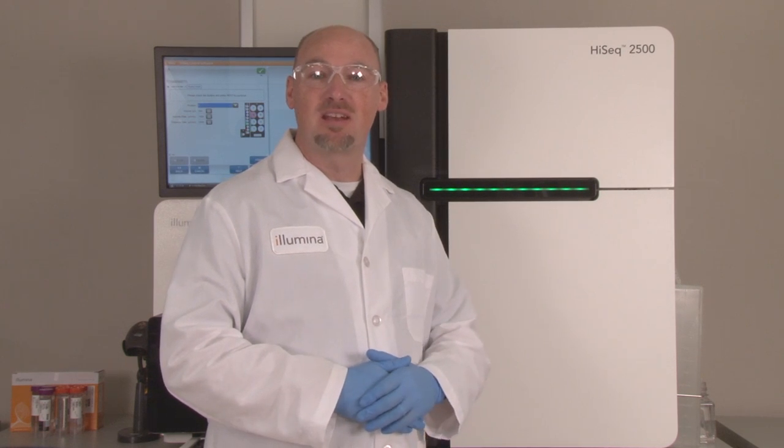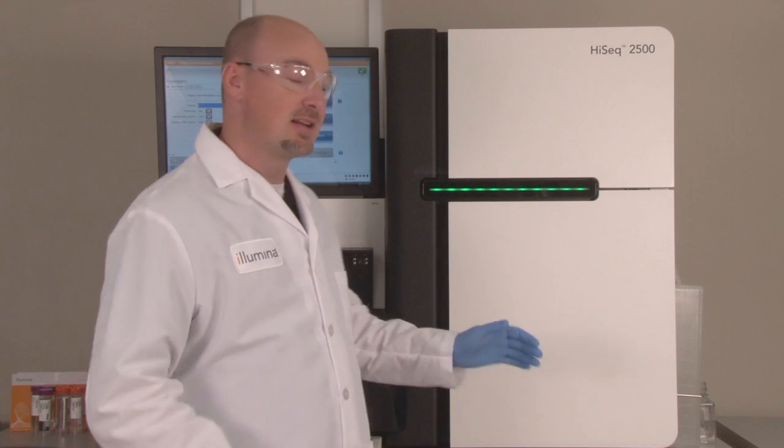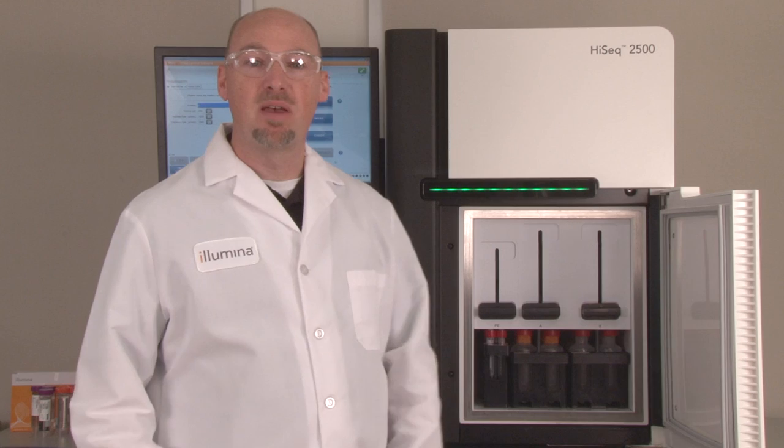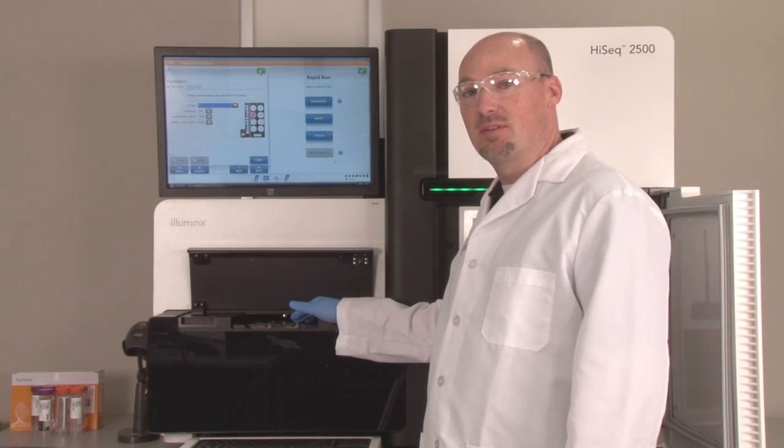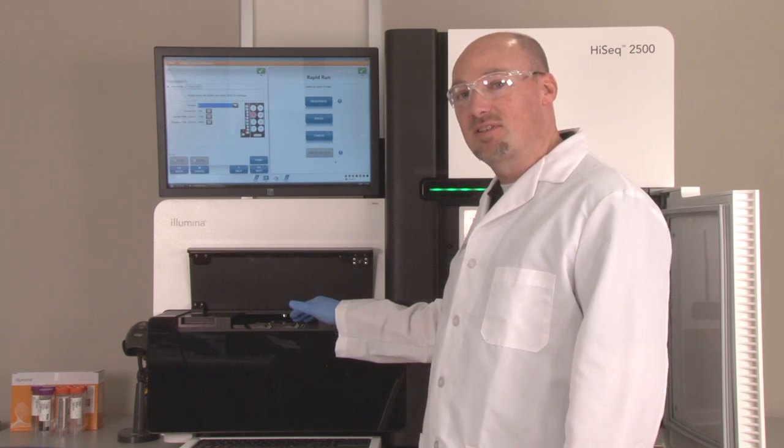The temperature for the SBS chemistry on the Hi-Seq is controlled in two locations: the chiller, which keeps the reagents cold, and the Peltiers found beneath the flow cells, which heat and cool the flow cells as needed during the SBS chemistry. Let's first take a look at the chiller.